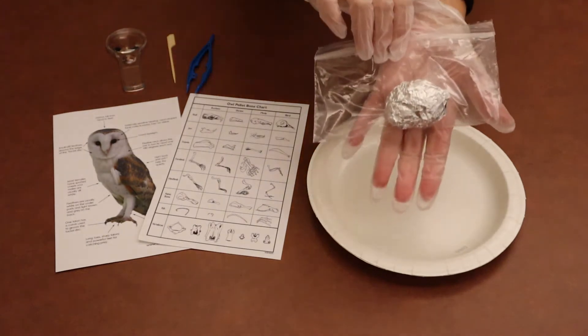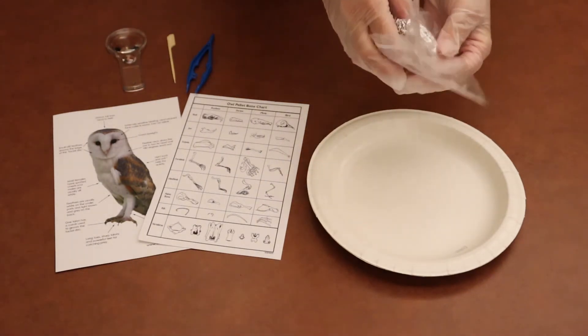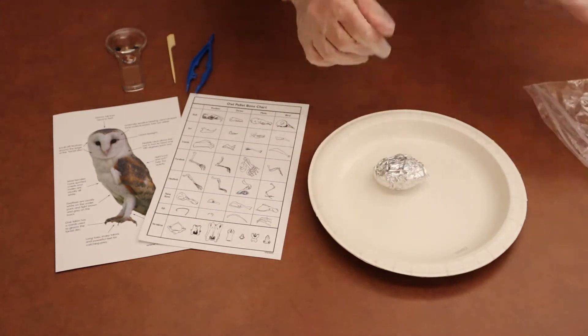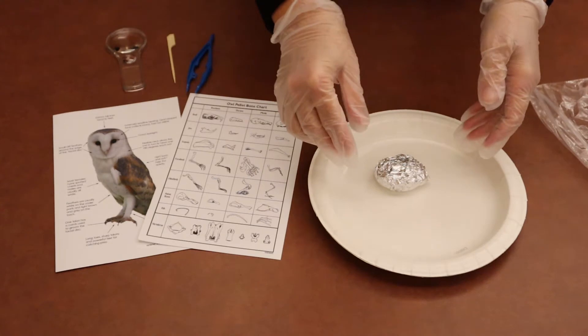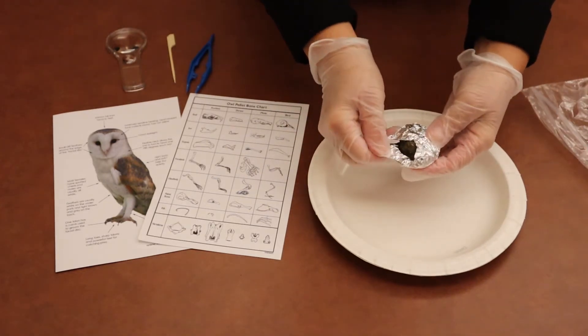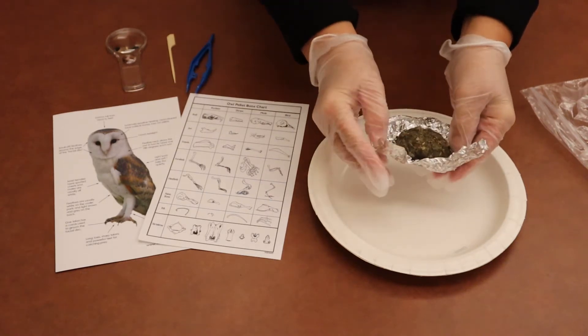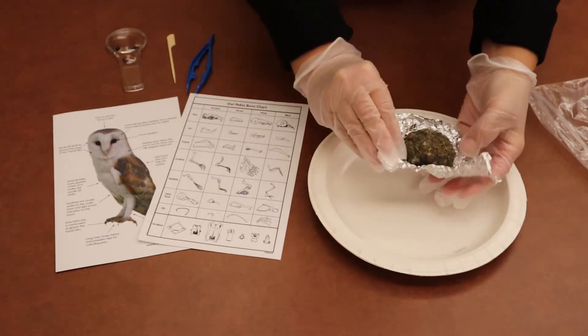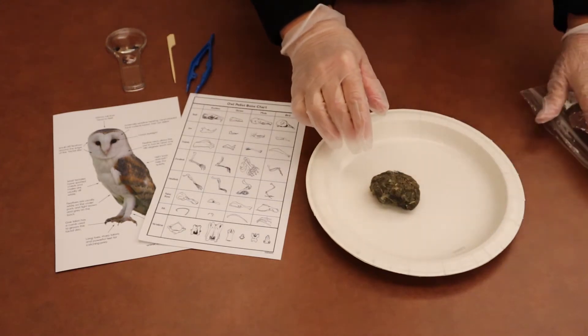For step number two, we're going to take the owl pellet out of the bag and set it on the plate. And then we're going to take the pellet out of the foil. So we'll start unwrapping it like this, and then once we get it unwrapped, we'll take it and set it on the plate and set the foil aside.